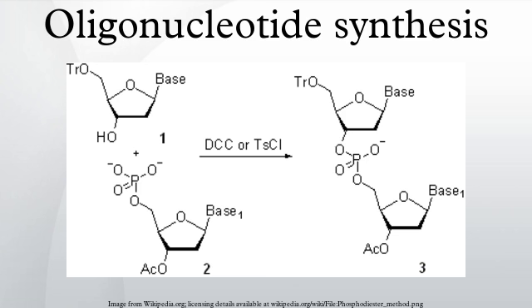The activated phosphoramidite in 1.5 to 20-fold excess over the support-bound material is then brought in contact with the starting solid support or a support-bound oligonucleotide precursor whose 5'-hydroxy group reacts with the activated phosphoramidite moiety of the incoming nucleoside phosphoramidite to form a phosphite triester linkage.